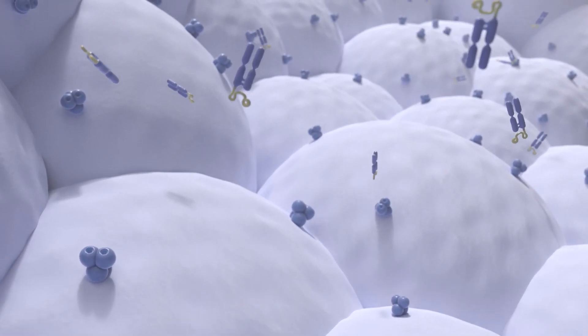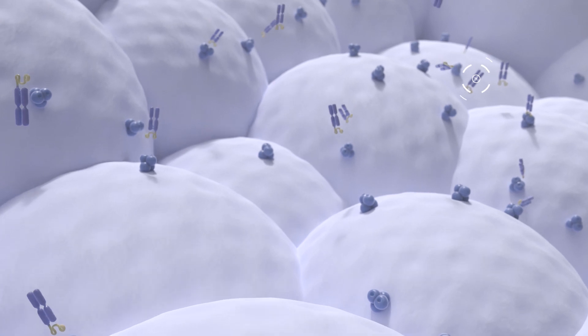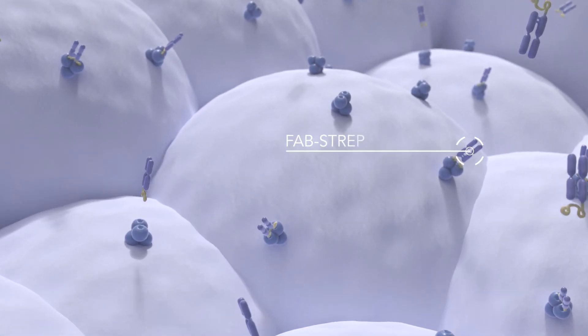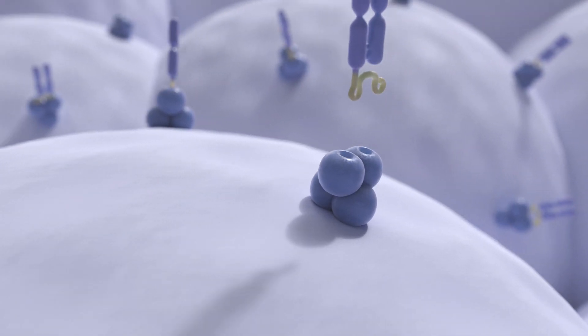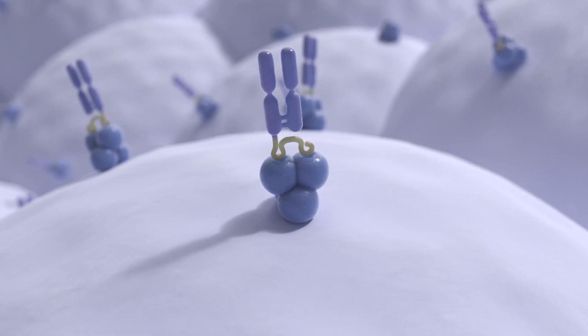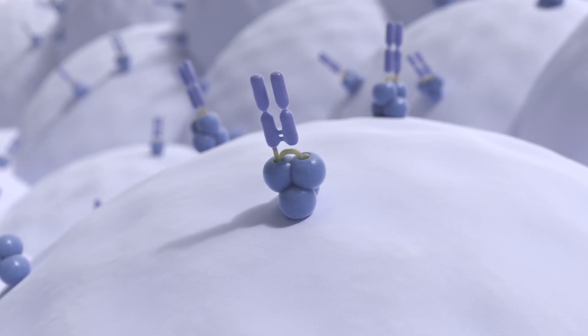Low affinity fab fragments harboring a Streptag, so-called fab streps, are attached to this matrix. And this multimerization of the fab streps promotes their binding to target cells with high avidity.